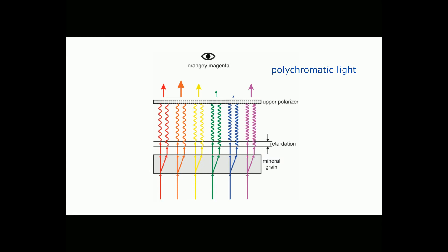If we rotate the stage, the relative intensities of the slow rays and fast rays will change, but they're going to change differently for each wavelength. So the interference colors will change. But every 90 degrees the grain will go extinct, and at 45 degrees to the extinction angles, we will see the maximum interference colors possible.